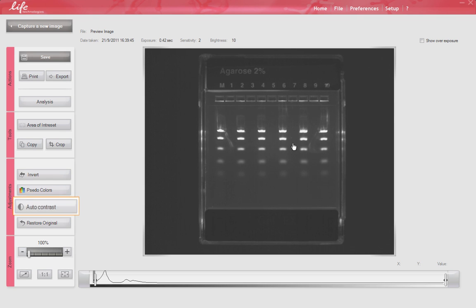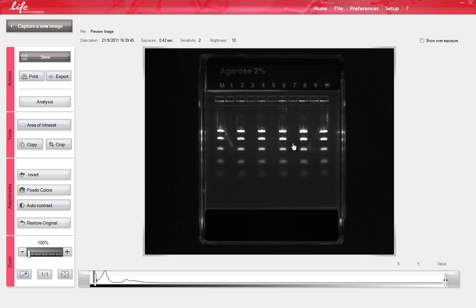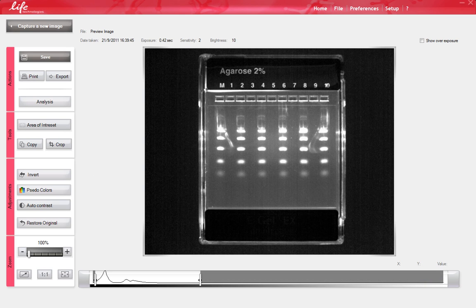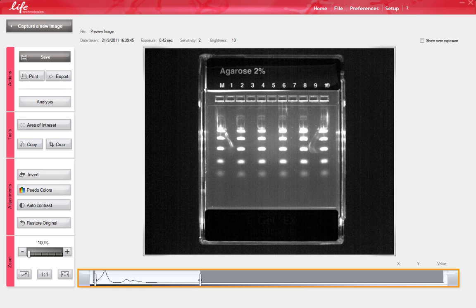Another feature is the Auto-Contrast tool. This enhances the signal intensity without manipulating the image. Notice that the histogram bars have moved after using the Auto-Contrast tool.